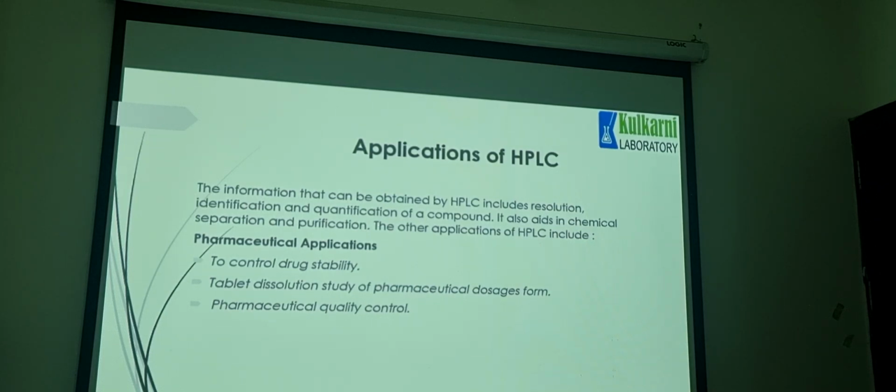You can find the HPLC technique is widely used in pharmaceutical industries, because there is a wide scope for the elution of any components or analysis. Analytical work is more based on HPLC in the pharmaceutical industry. Okay.